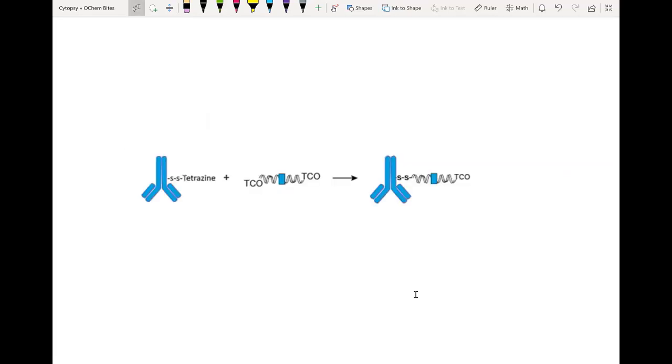We utilize the tetrazine which is already attached to our antibody via those disulfide linkages to make the final conjugate in high yield.